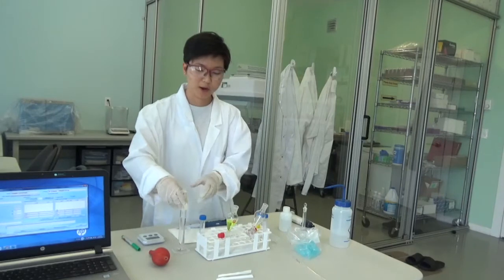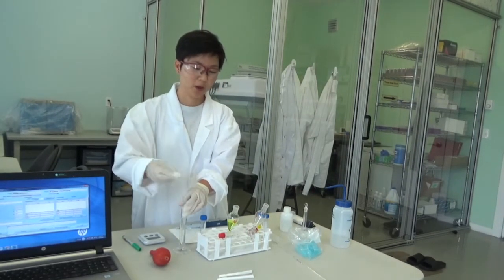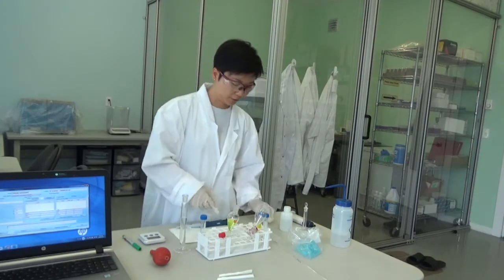Next we are going to add 5 ml of chloroform to extract the anionic surfactant from the aqueous layer.